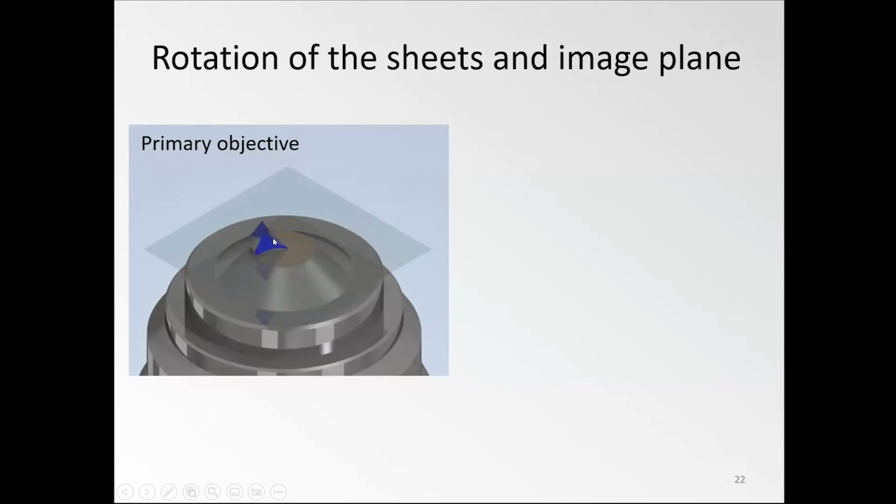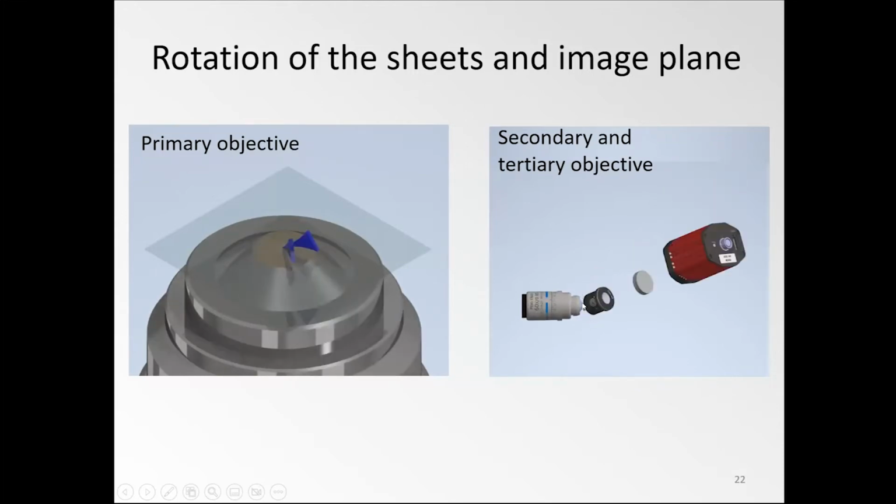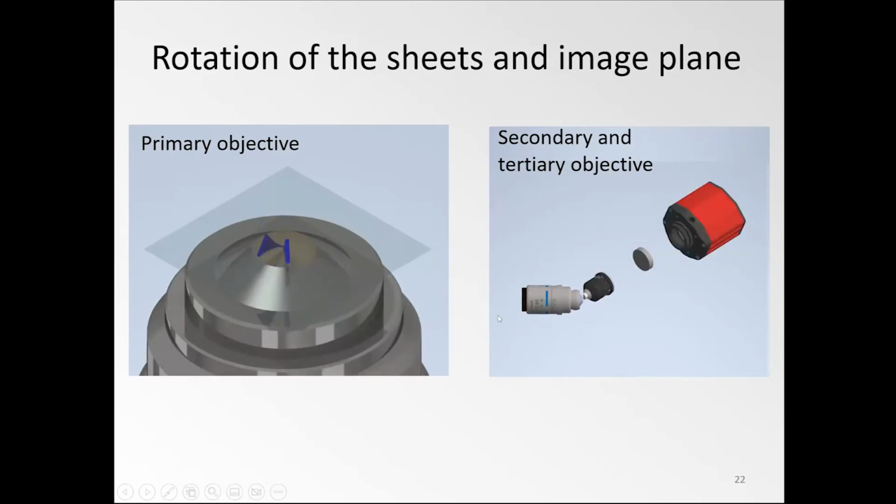There's a little caveat, because if this plane that they span or propagate in rotates, then also the tertiary imaging arm would need to rotate, because whatever happens here is mapped over here in that remote space. And to form a sharp image, you always want to look orthogonally onto the light sheet plane. So in principle, we would need to build an apparatus that rotates this entire arm, which, yeah, I would also not want to do. This alignment needs to be rather precise, and once it's aligned, you wouldn't want to touch it. And it would probably also be prohibitively slow.